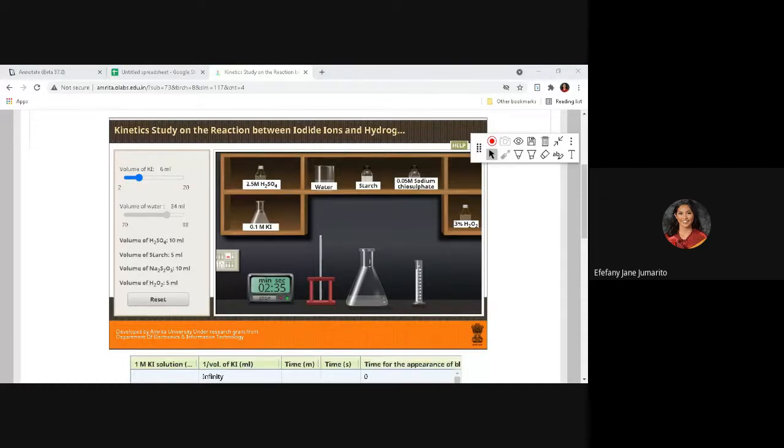So there is a reaction when there is an evolution of bubbles. Okay, it bubbles. The time stopped, ma'am. It stopped.